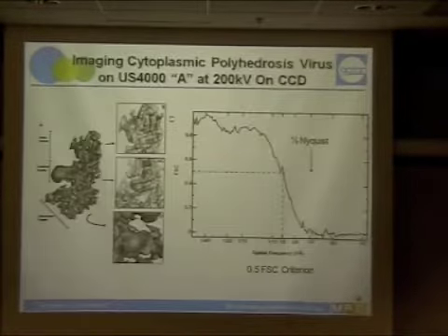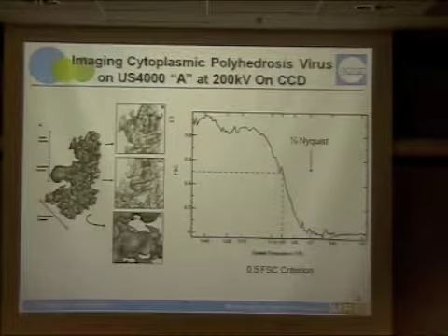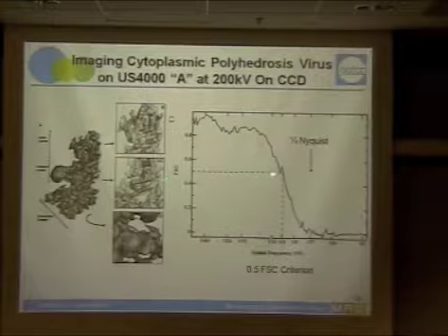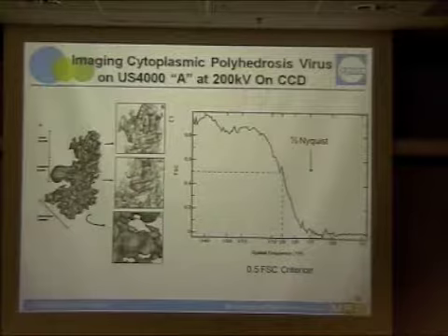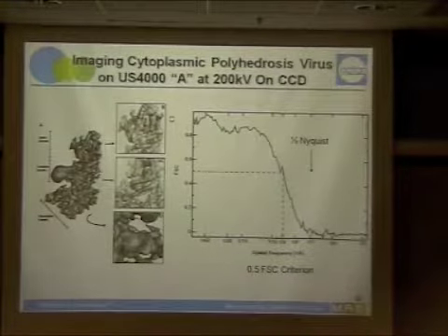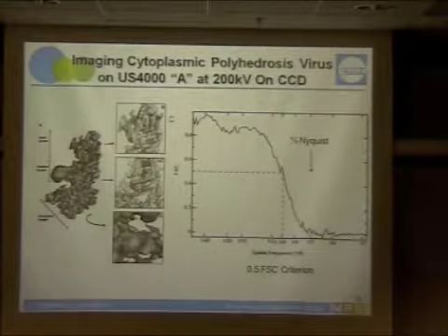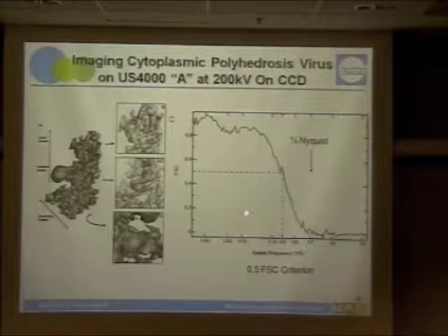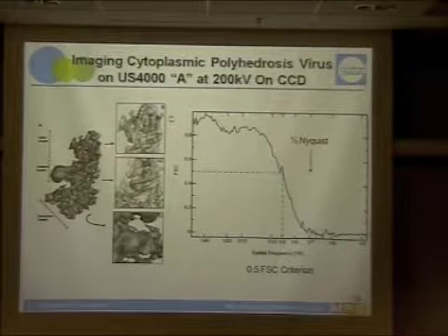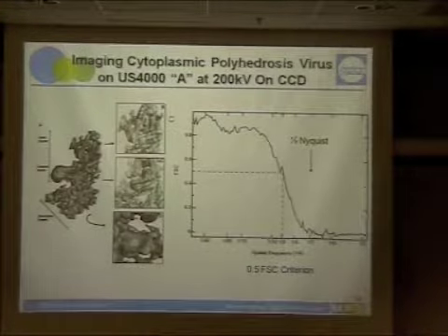So nevertheless, we went ahead and we took images of that, and we did a reconstruction. And the resolution that we assessed of the reconstruction landed at about 2/5 Nyquist frequency on the CCD camera. So we were getting a little less than 2 effective pixels, if we want to use that terminology. And I just put this image here to show you that when you see these curves, they don't always mean that that's the actual resolution. So if you look at the data and you see features that you expect at that resolution, then you can start to believe it.